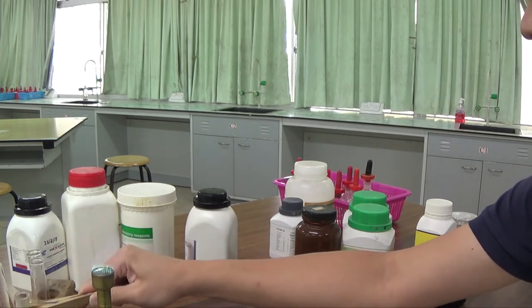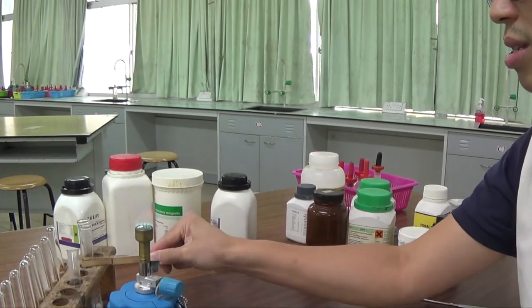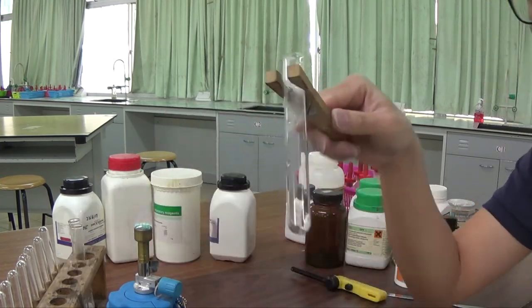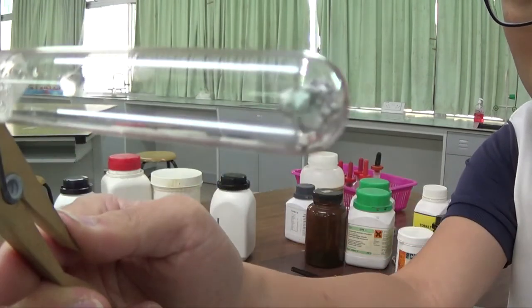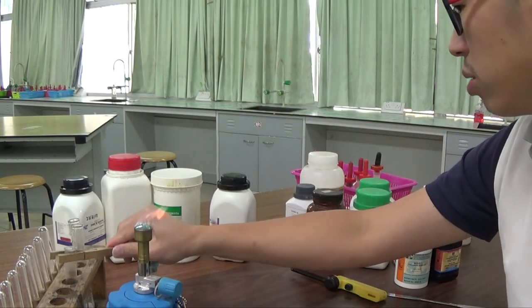So that was the copper 2 sulfate hydrated. The blue solid has gone. So I've got a colorless liquid formed on the upper part of the tube. The blue solid has gone white. Okay, the blue solid has gone white. Not too sure how clear it is there. All right, let me show you the cobalt.